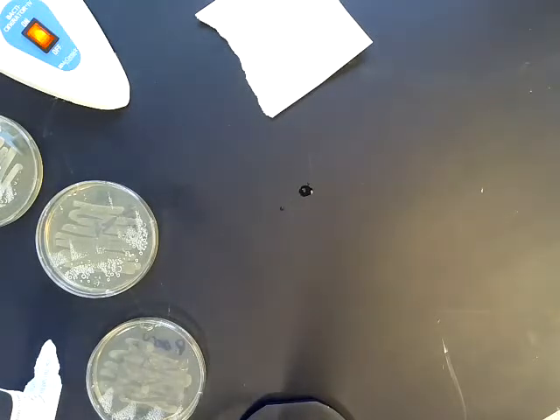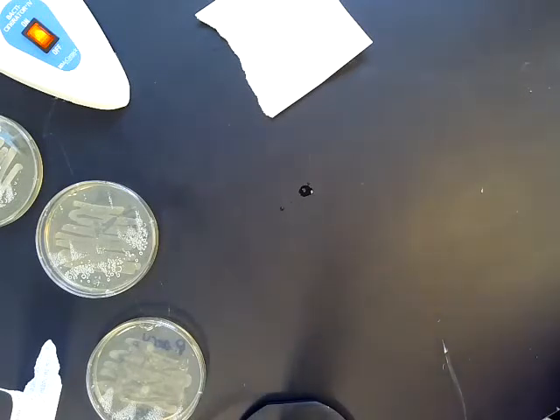In this video, I'm going to talk about the IMViC. The IMViC is an acronym for the different tests, the 4 tests that are found in this system. I is for indole. The indole test evaluates the microorganism's ability to break down the amino acid tryptophan. When tryptophan is broken down, indole is produced.